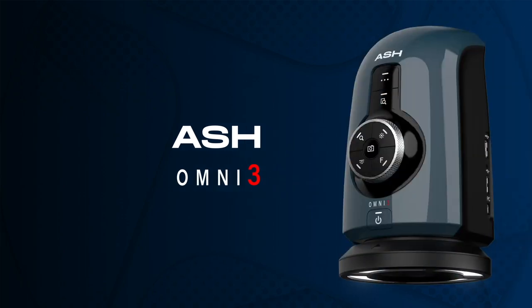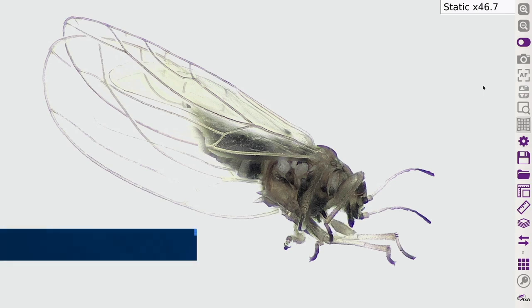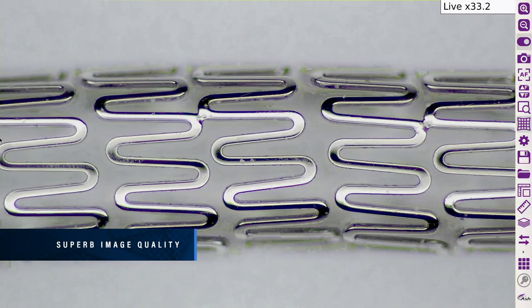The Omni 3 Digital Microscope and Measurement System incorporates the AshCam Plus, a 30x zoom lens camera module with a host of new benefits for smarter inspection and measurement. Experience unrivaled, crystal clear, full HD image quality from the powerful AshCam Plus, specifically for critical inspection and measurement tasks.